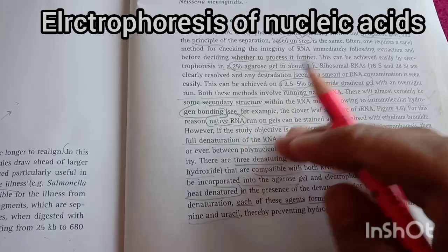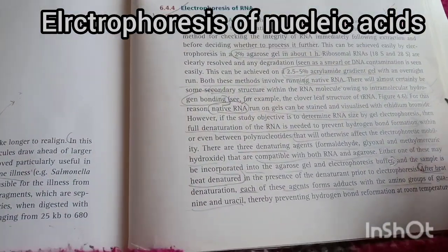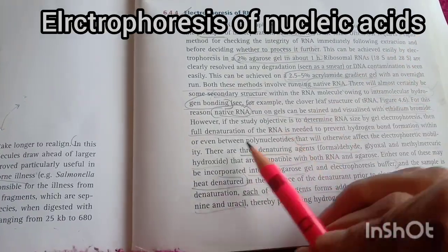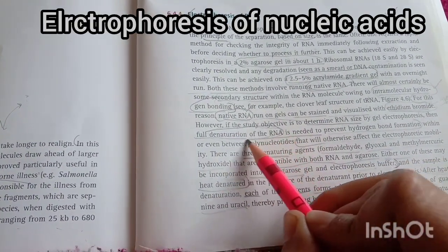However, if the objective of the study is to determine the RNA size by gel electrophoresis, then full denaturation of RNA is needed. Denaturation means the breaking of the hydrogen bond.